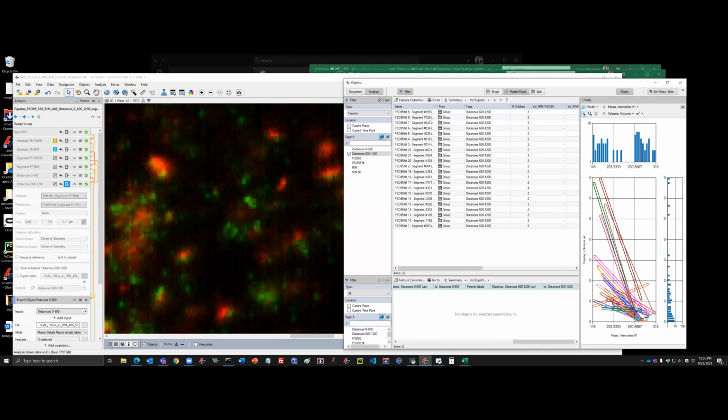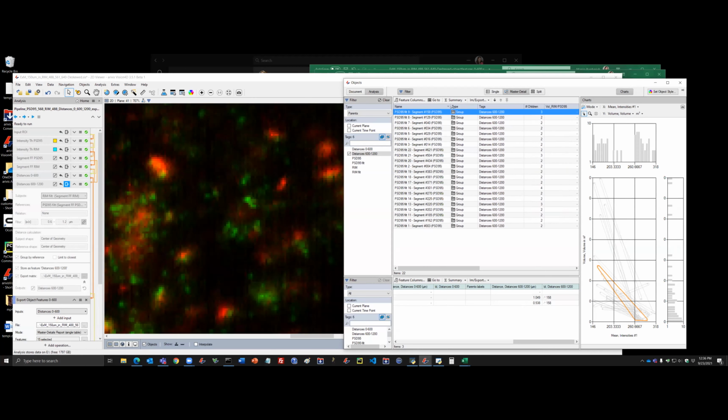In some cases, we have more than one rim particle per synapse, because we actually create the groups for each of the synapses, where a group is basically a new type of object that exists in Vision 4D.